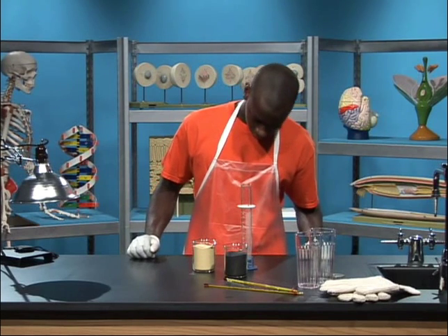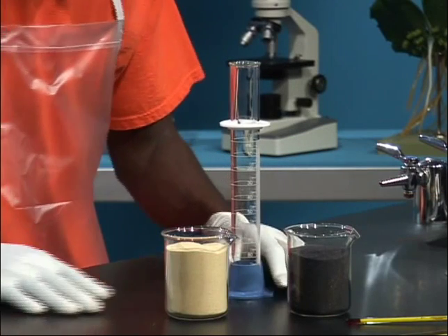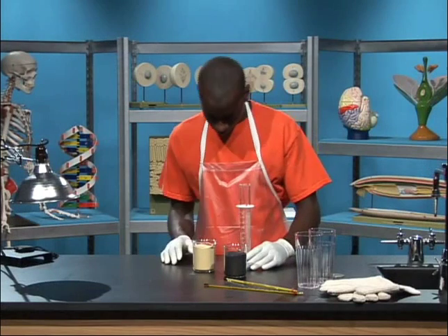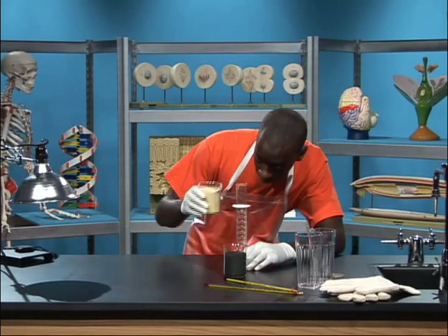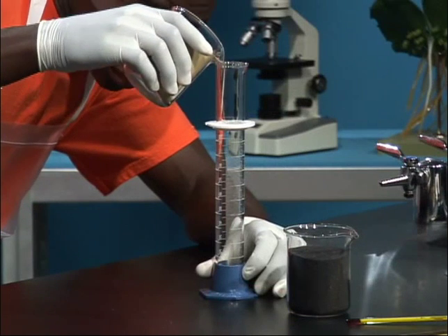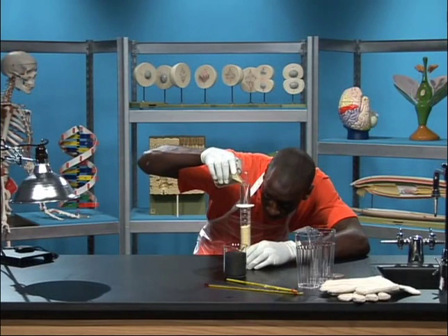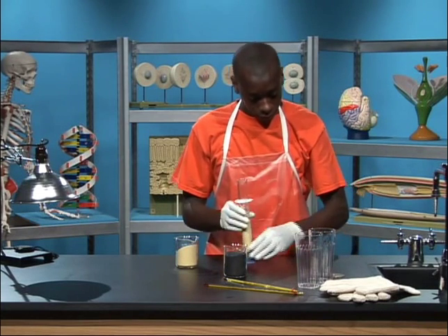Begin your first measuring exercise by preparing a data table like this one on a sheet of paper. On the lab table is a 100-milliliter graduated cylinder, some light-colored sand, and some dark-colored sand. Use the graduated cylinder to measure exactly 75 milliliters of the light-colored sand. When you have the required amount of sand measured in the graduated cylinder, pour it into one of the plastic cups.